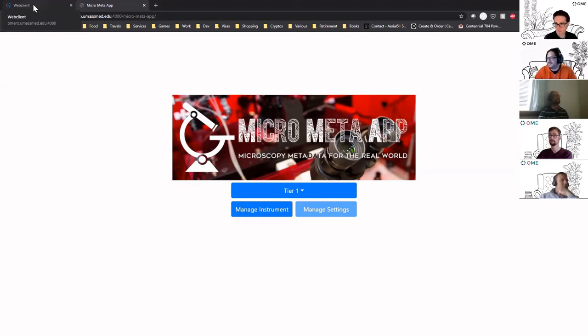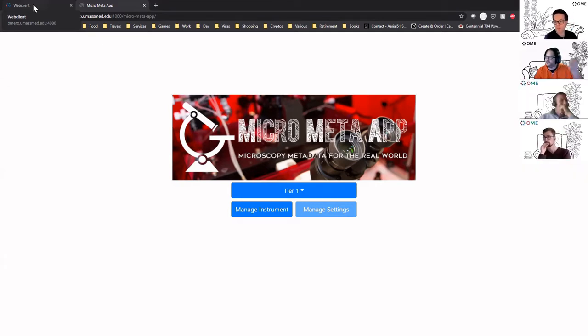So, a question from Matthew, and then there's another question in the chat. Matthew, go ahead, please. What sort of output format do you get from this? Everything is JSON. JSON files are human readable, in case you compact them, because otherwise it is a lot of information when you have 200 planes.